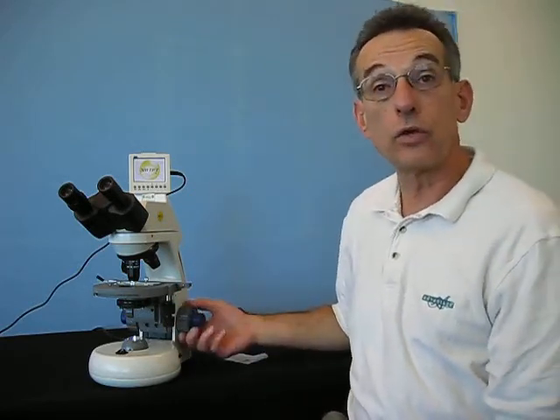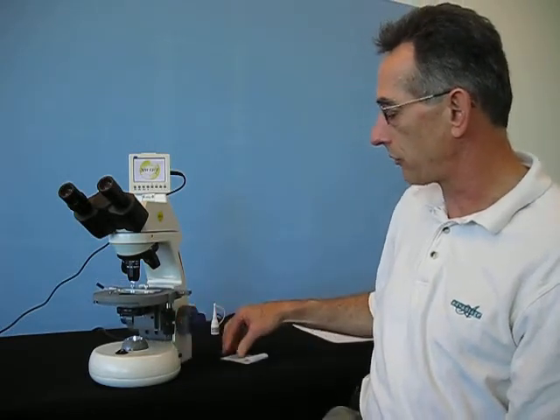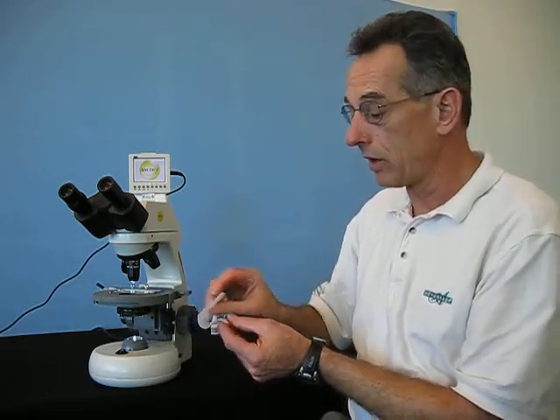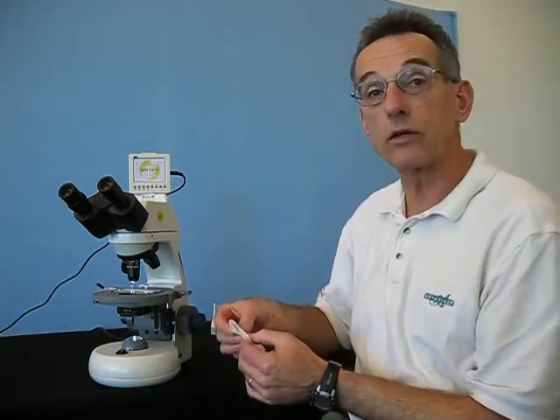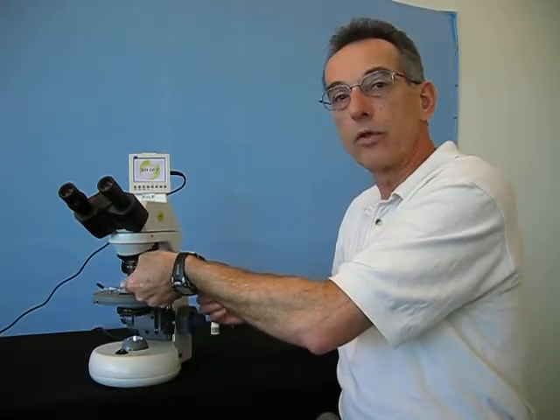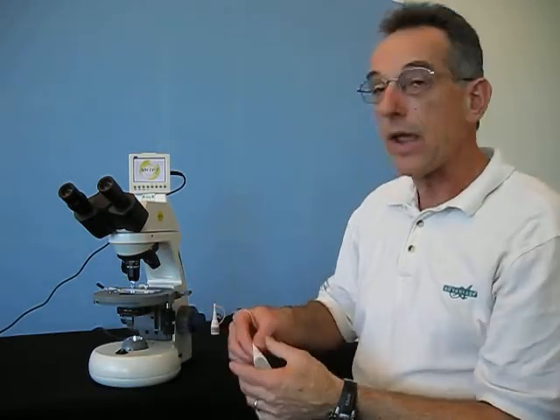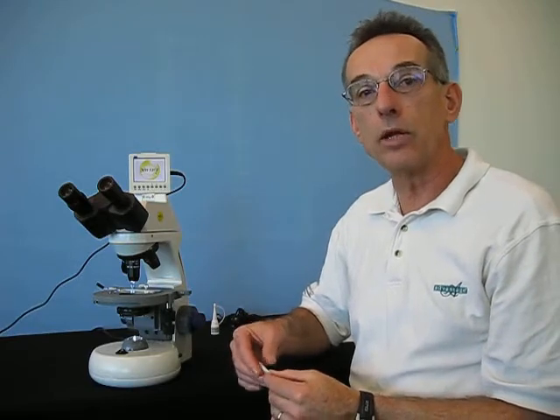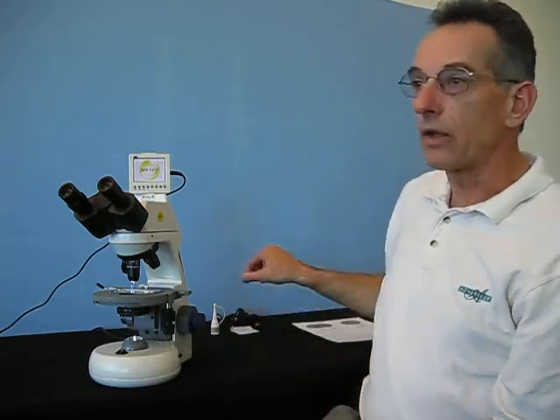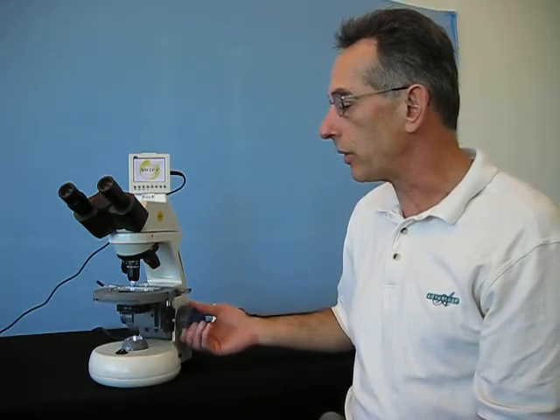After you are done using oil, drop the stage, take a piece of lens tissue paper, and make certain that the objective lens is thoroughly cleaned. Just rub it vigorously over the bottom of the objective lens and that will remove the oil. This will prevent a buildup of oil over time, which will turn into a thick cloud and obscure your ability to see clearly with that lens.